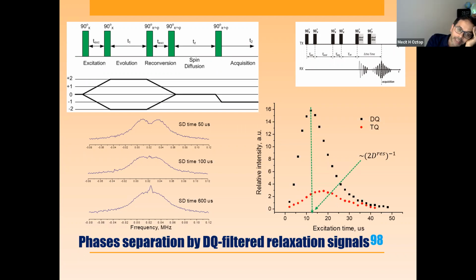And as you know, in our lab we have two of your systems, one with a larger coil and the other with a much more homogeneous field. Can we also apply this DQ filtering on the lower field system, which has longer RF pulse durations? In principle, yes. The thing is that I don't remember what the dead time is. I can check it, but around 20.